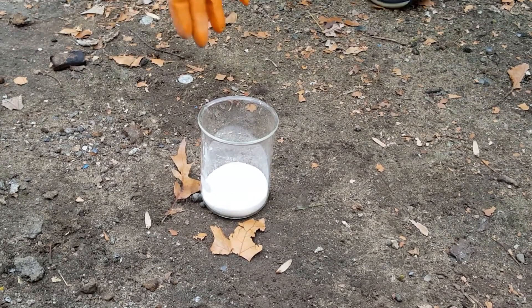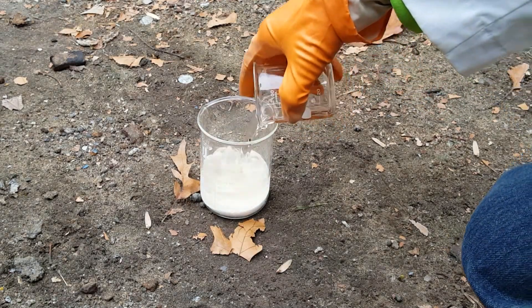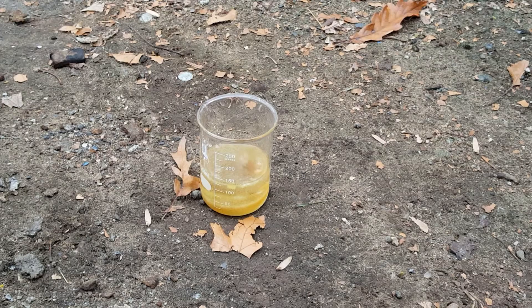Here's our beaker full of sucrose. Now that we're outside and I'm not going to get nasty-smelling sulfur compounds in my clothes, I'm going to add the sulfuric acid. Stand back and watch. The sulfuric acid will take a moment to begin dehydrating the sugar. Once you see the black carbon start to form, that's when the sulfur dioxide is starting to be produced, and you'll want to stand back.